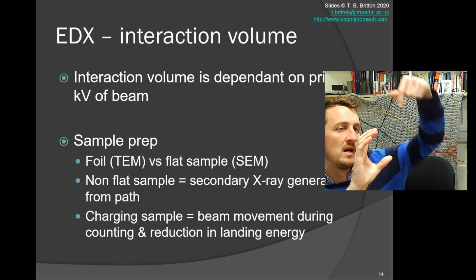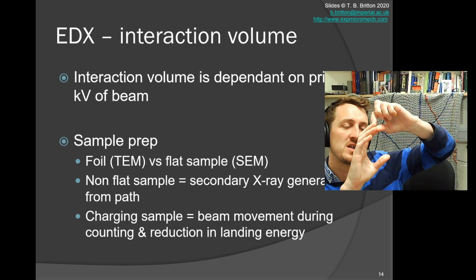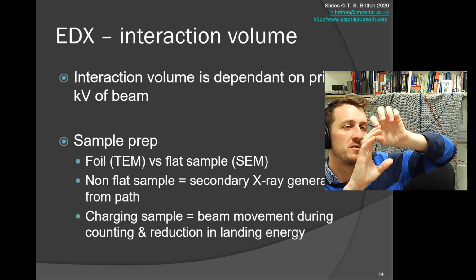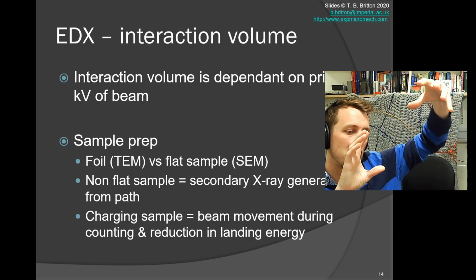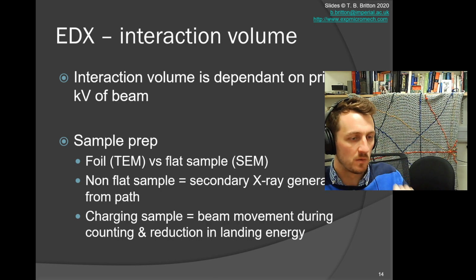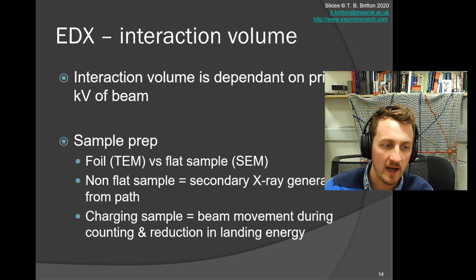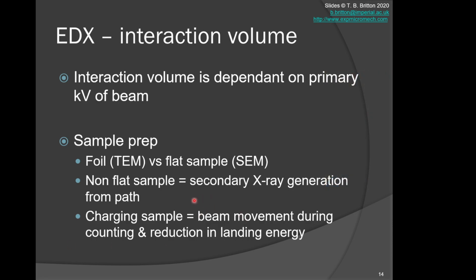a slightly tilted sample, if you scatter the beam into this claw-shaped, the beam can tunnel through or get through the material, it will go through the material, and the X-ray generation will be from here, and also the scattered volume beneath that could then perhaps be collected at a detector over here. Okay. If the material was bulk, then of course the volume is now much more classical. The nice thing is that the Bremsstrahlung gives a strong indication of the scattering cross-section. So ideally, if you want to do this well, you have a flat sample, life becomes easier.